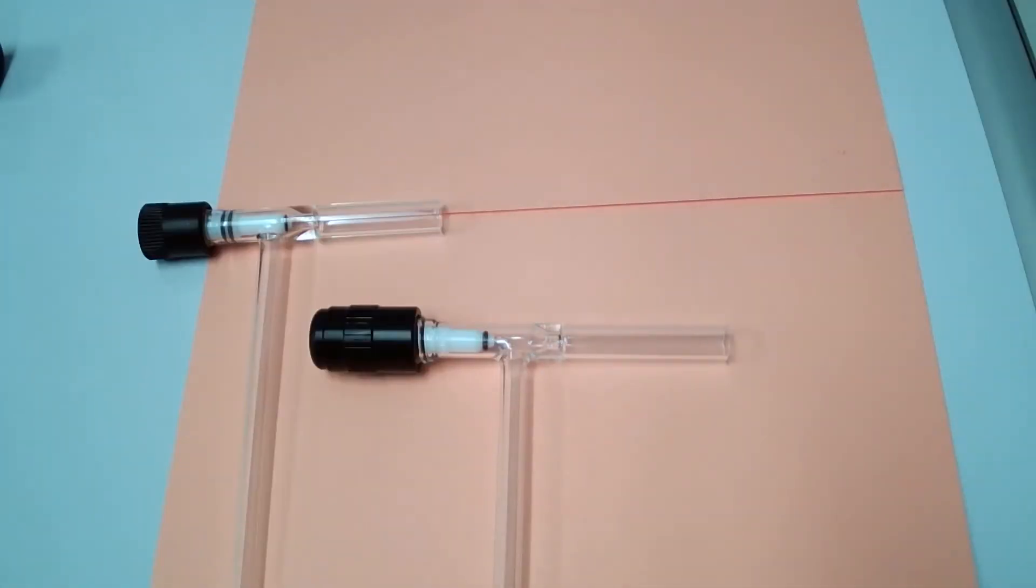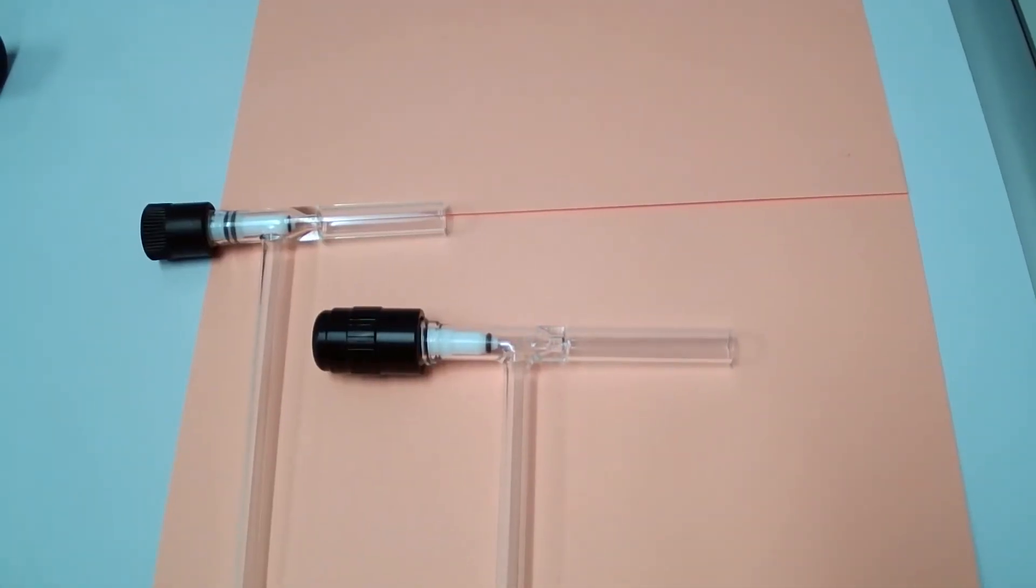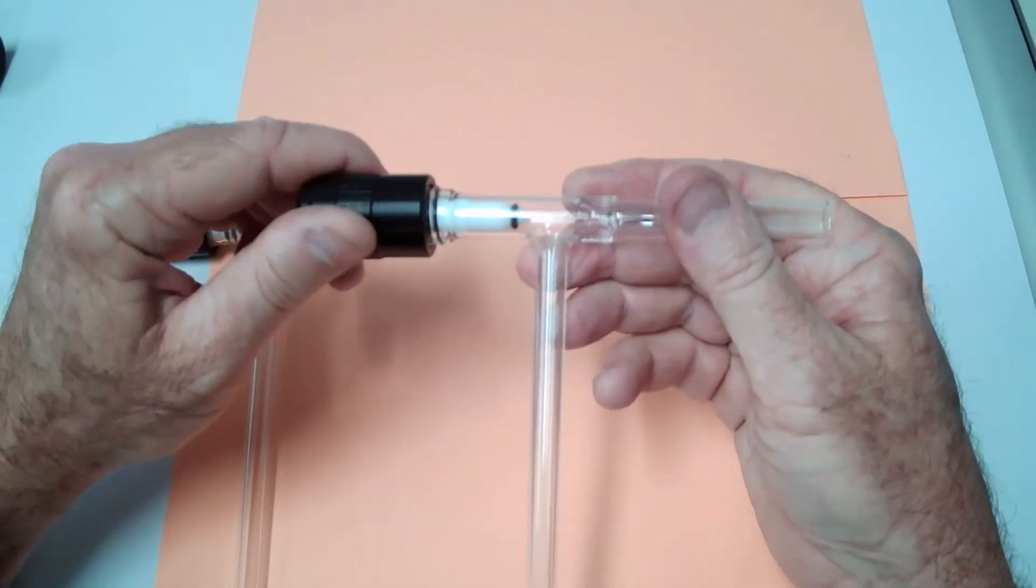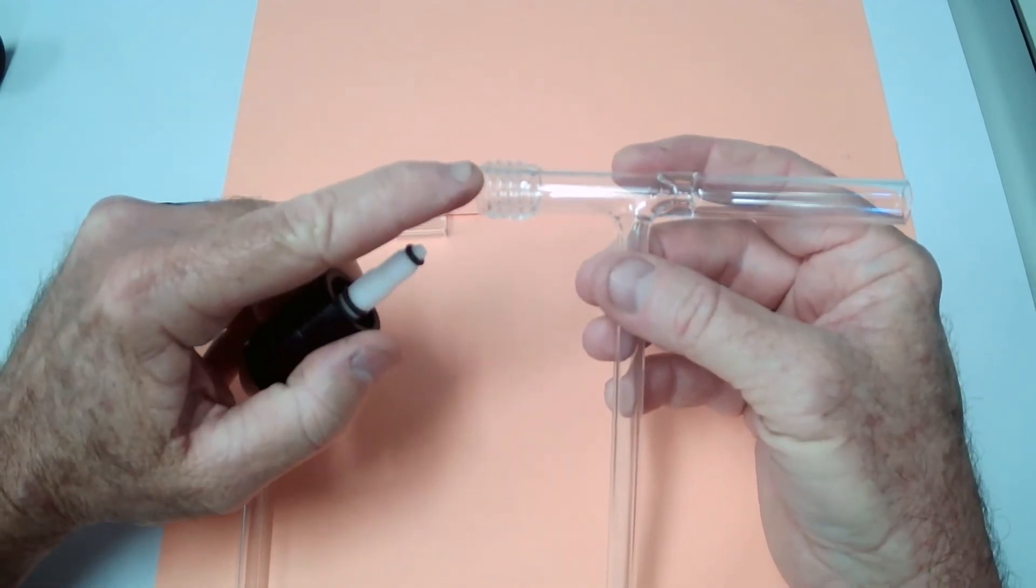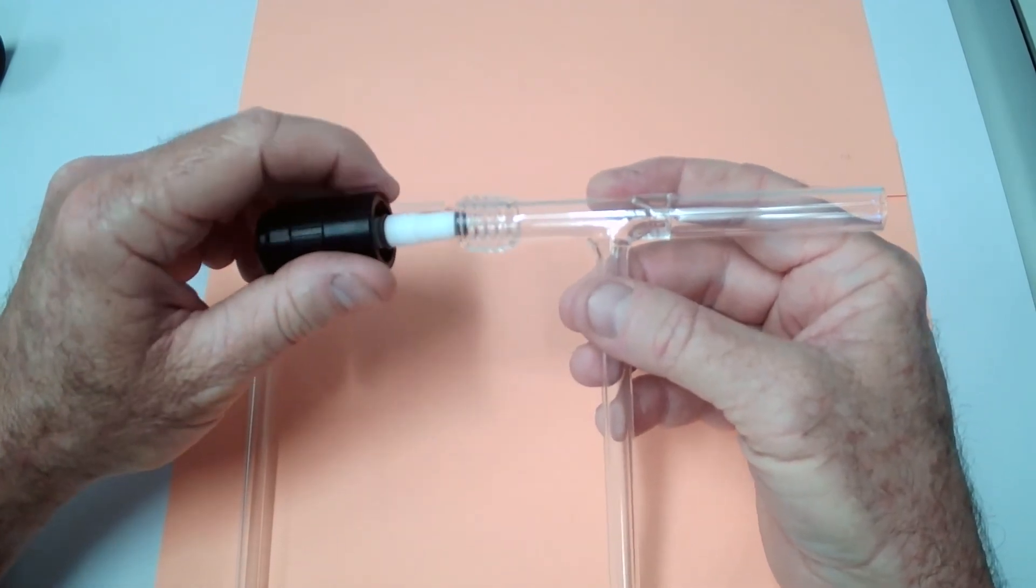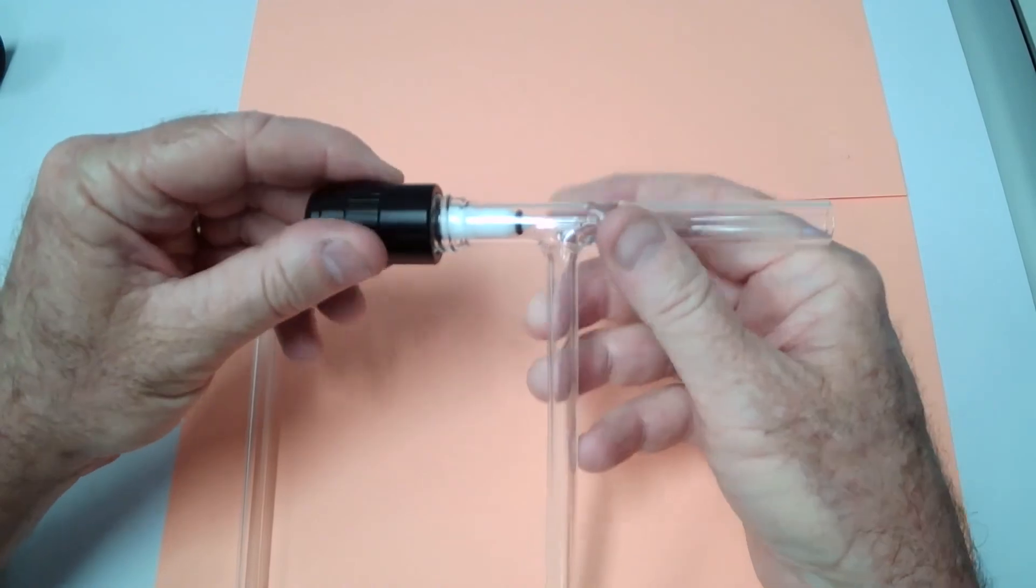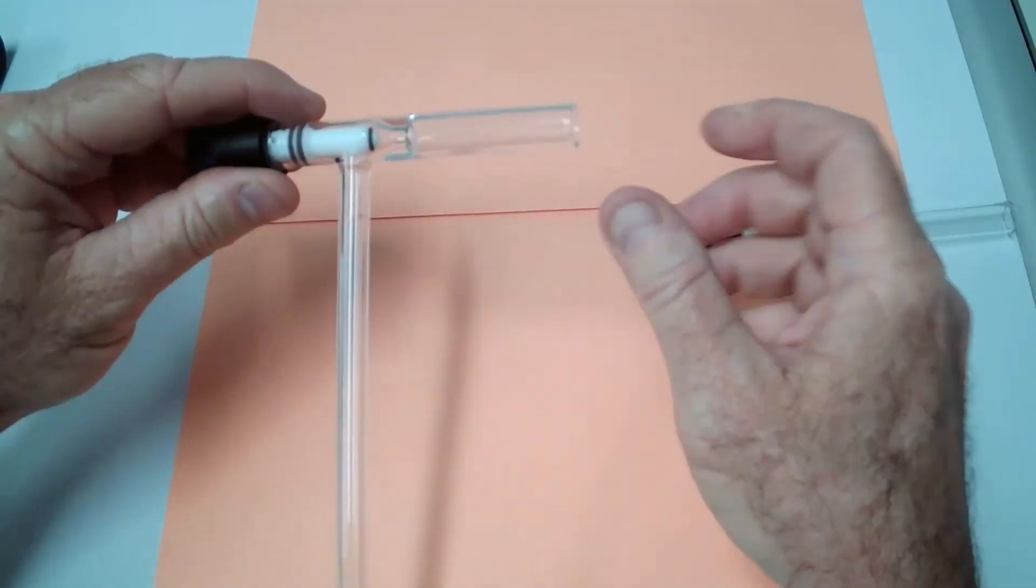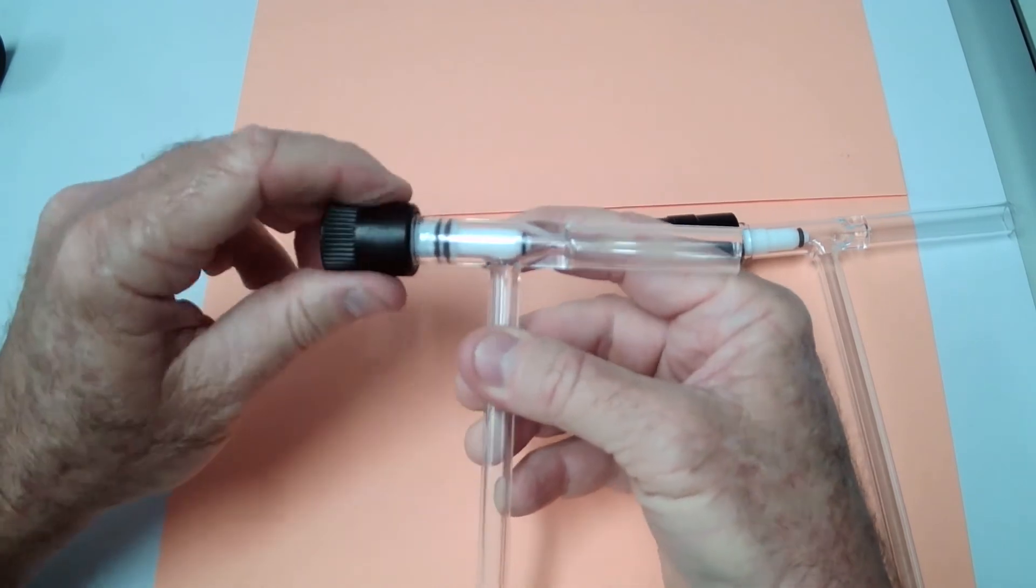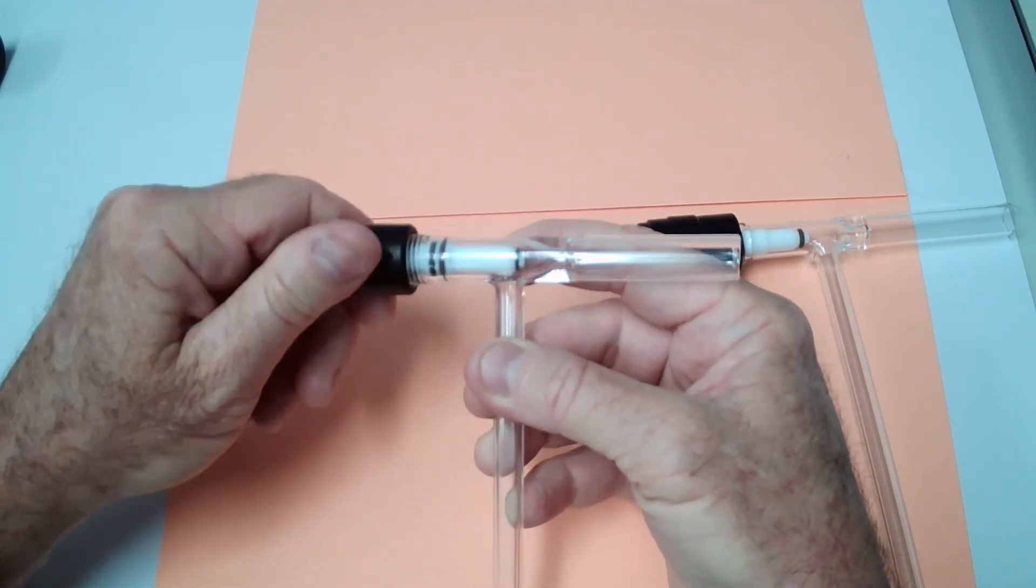There are different styles from different manufacturers of high vacuum valves. This is from a manufacturer that utilizes coarse threads for their valves, so it is a faster opening and closing. Whereas this one has finer threads, and they are both external threads.